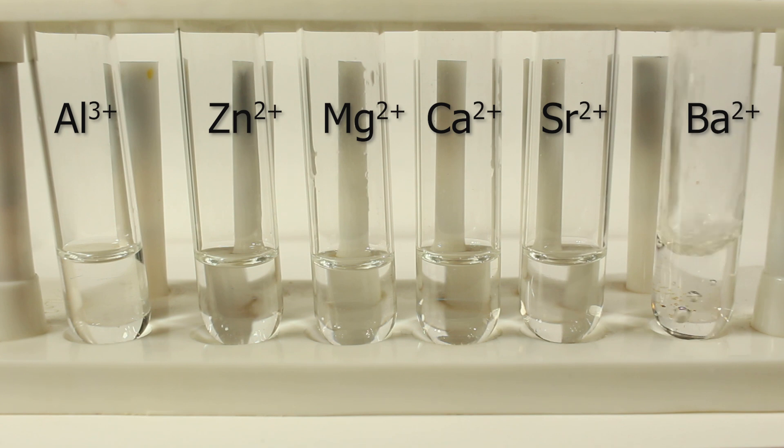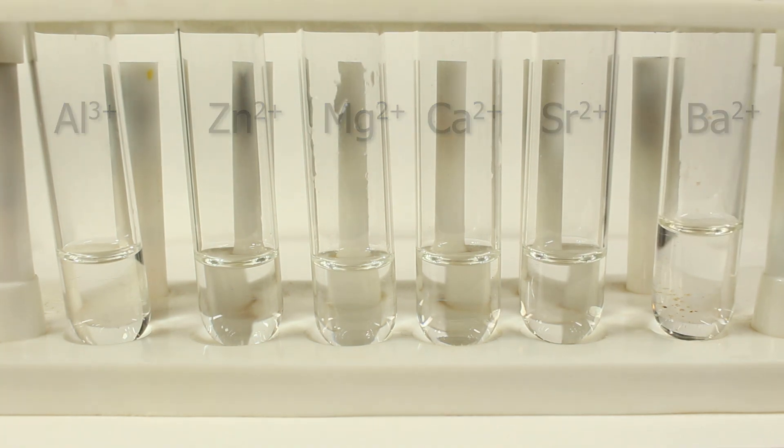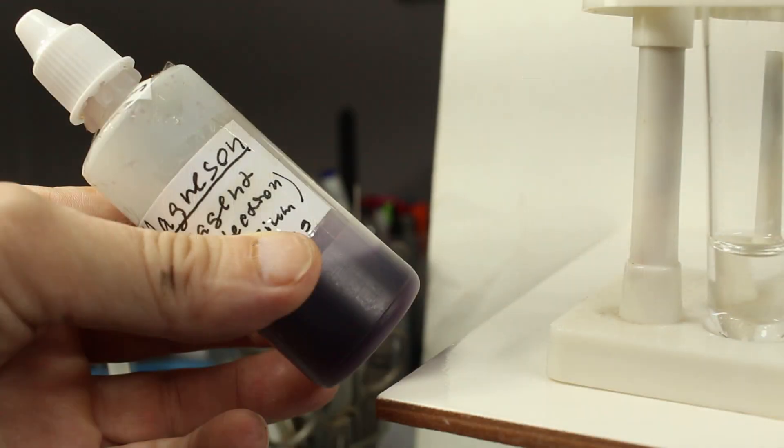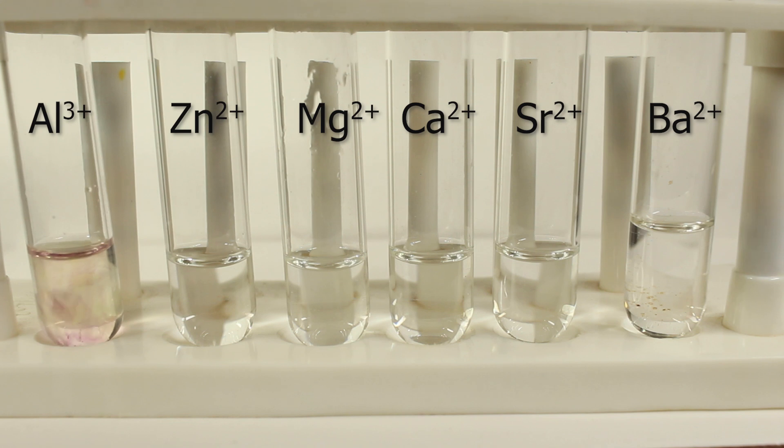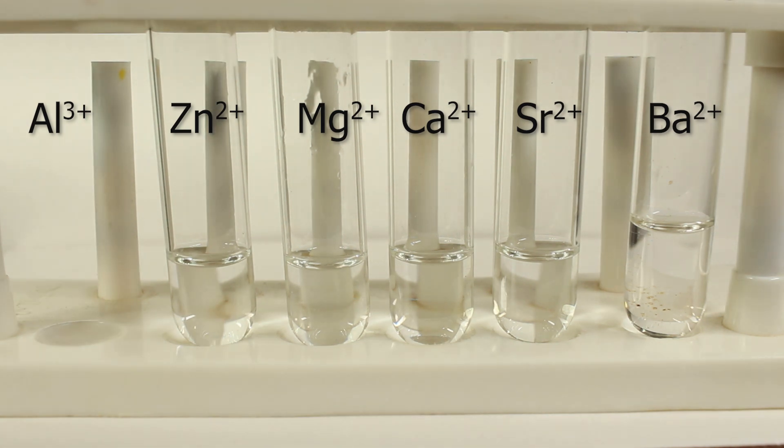Now it's time for magnesium reagent or azoviolet. It's alkaline, so I expect the precipitates of hydroxides. Here aluminum hydroxide is precipitated.